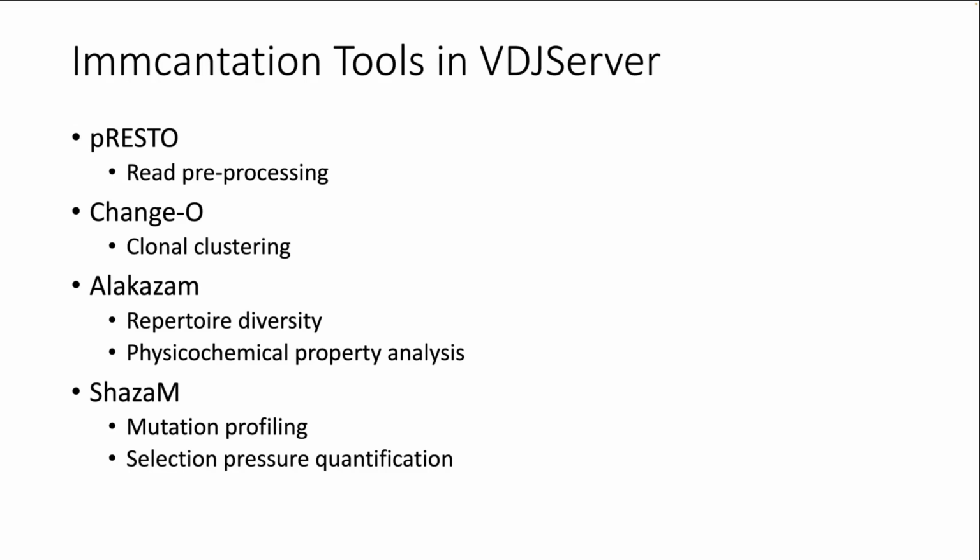Change-O for clustering and doing clonal assignment, and Alakazam and Shazam. So these are sort of the downstream ones. As I say, we have a number of other tools. I won't list them all out there, but I'm welcome to give you information about that if you're interested.